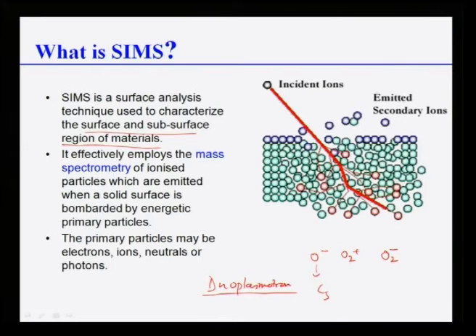Basically, this is nothing but a sputtering process. You are bringing in primary ions and sputtering. You can sputter more material effectively because of their greater mass. It is normally used to extensively measure the different isotopes. And when you use insulating material, you can always use Cs plus beams. As you know, most of these are surface ionization processes, so it leads to heating up of the samples, and sometimes it can create other problems also.